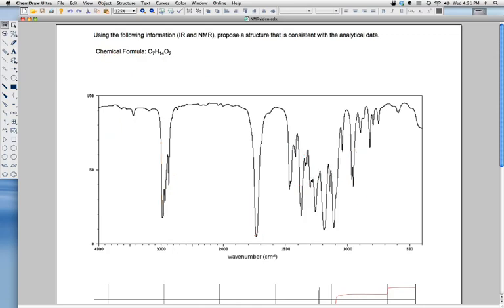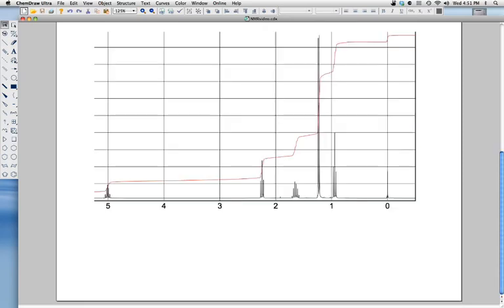Okay, so we are going to scroll down and take a look at our NMR spectrum now. What I want to do is keep in mind that we need to remember a couple things. So I'm just going to, on this side here, write down a couple things that we've learned. What we learned is we have a carbonyl somewhere. We'll put this information over to the side of things that we need to remember. That was our 1 DBE. And then obviously we have sp3 carbon to hydrogen bonds in here as well.